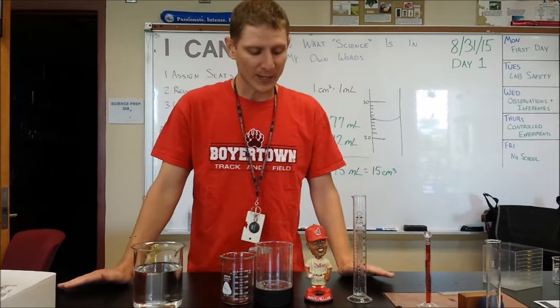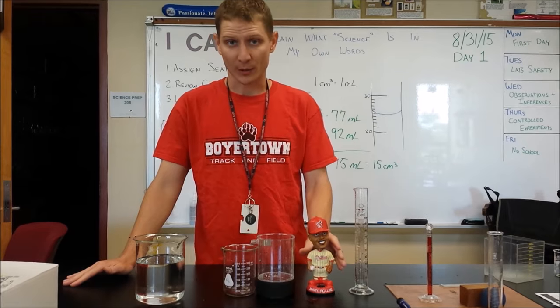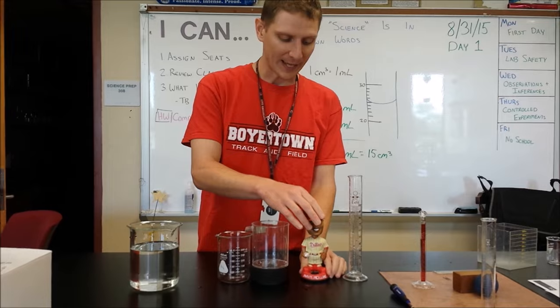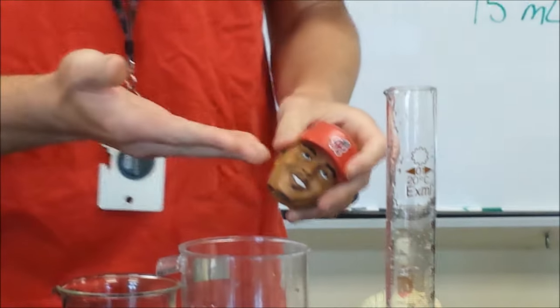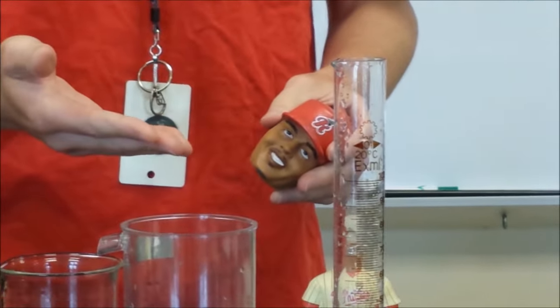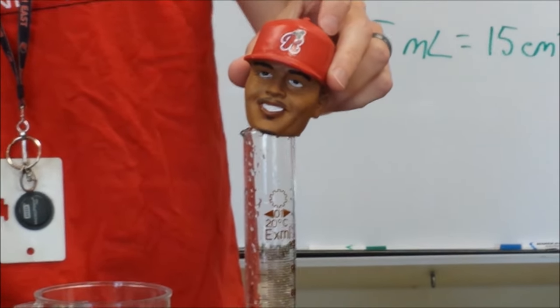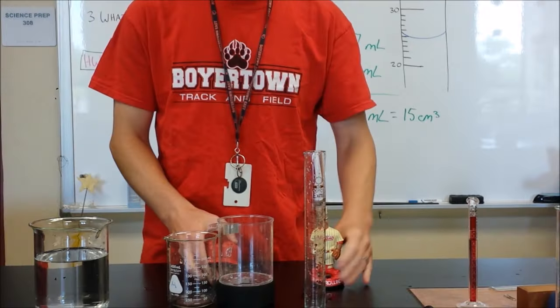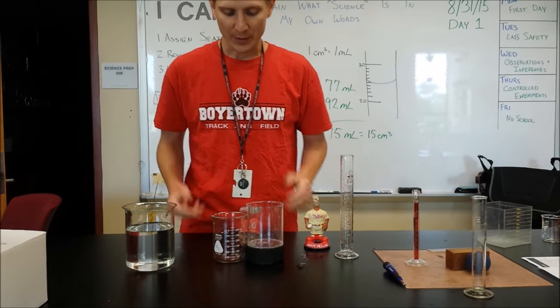Alright, so what we're going to work on is finding the volume of an irregularly shaped object that's a little bit larger. So we're going to be working with Jimmy Rollins, and we're going to work with just his head. Now what we learned in the last video is that if we're trying to find the volume of an irregularly shaped object, we would use our graduated cylinder and we would use displacement. But you'll see that Jimmy Rollins doesn't fit into our graduated cylinder. So instead, we're going to be using an overflow can.